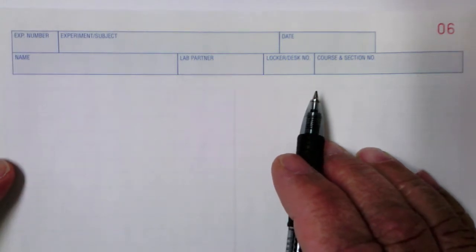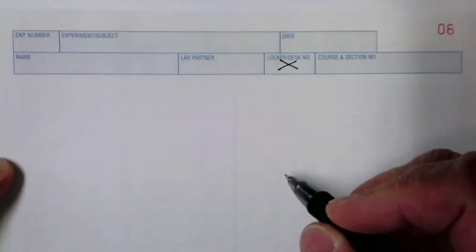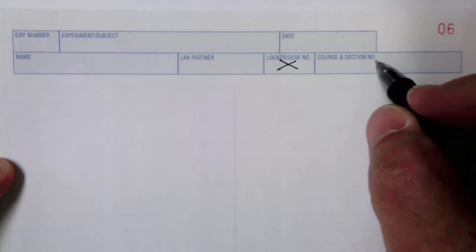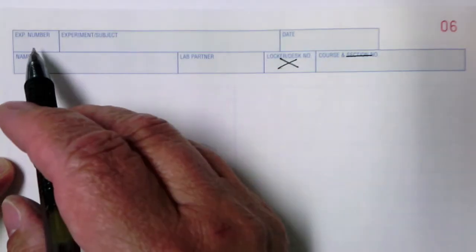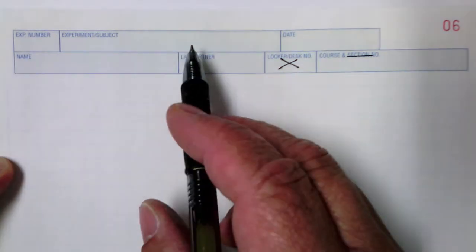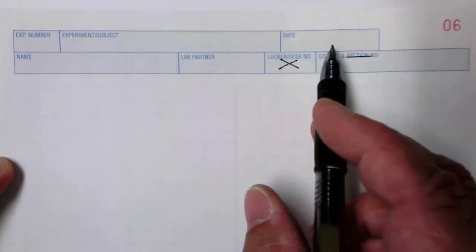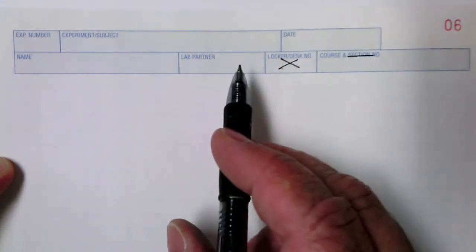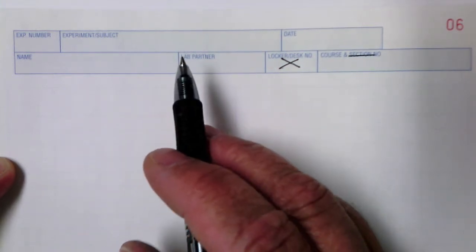All right, header information needs to be filled out. There's a couple things that you can skip. You can skip the locker desk information, and if you want to, you can write the course in here. There's no section number, obviously, but you could write the course in there. Experiment number, if it's given to you, write it down, so that's optional. But you should always have the experiment, the title of the experiment, the date on which the experiment is conducted, your name, and your lab partner's name. Those are musts. Failure to completely fill out the header will cost you points.